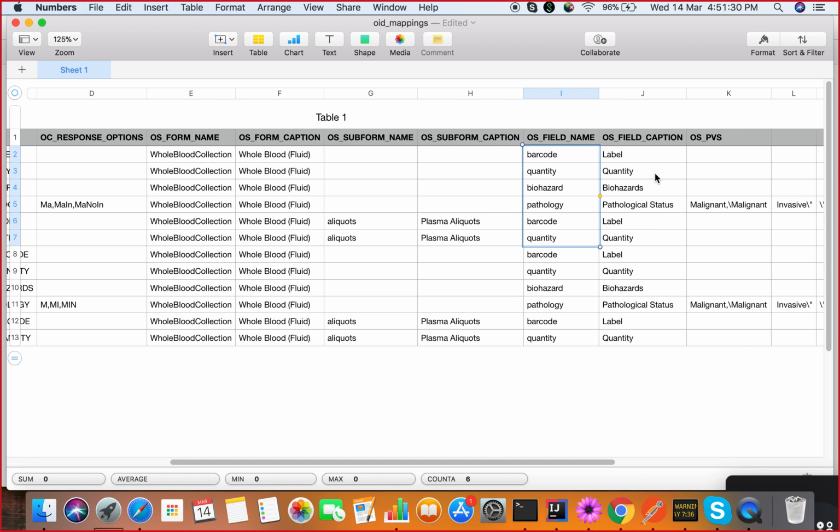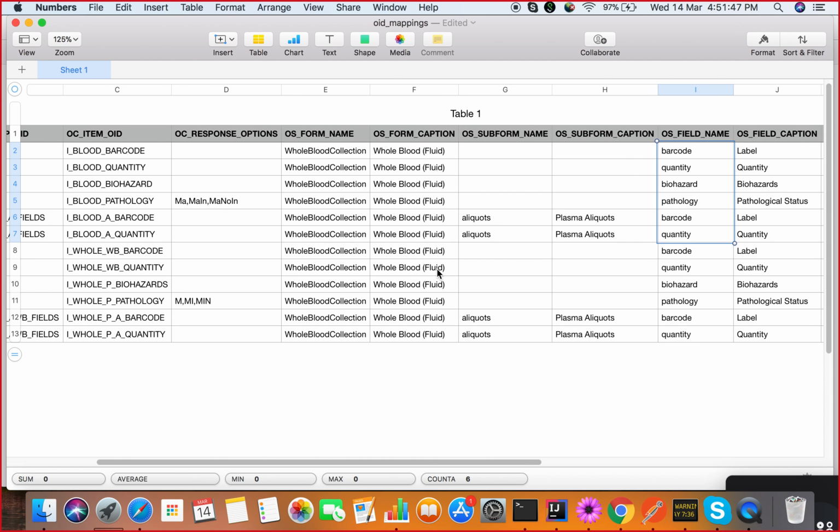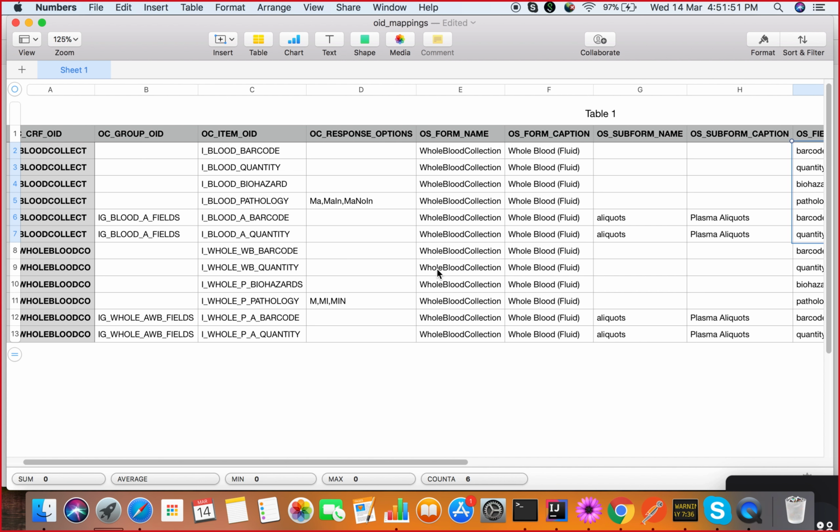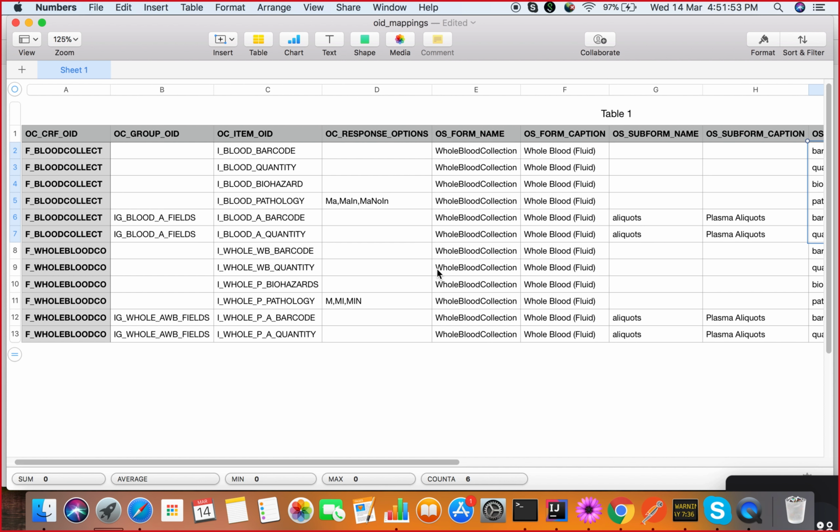We will have to do both. The field ID is what is in the back end for them, and the field caption is what we will see as a user. So if in OpenClinica we have one that is correct, so it's SP1SC and we want to keep that, then the caption should be blank. But if we want to correct it, we will correct the caption for another CRF. So that's how I get it. Yeah, but by security, we should always correct it.